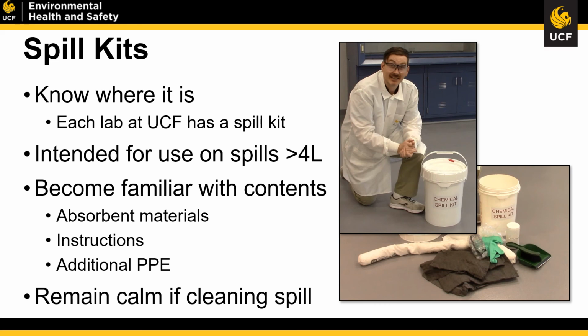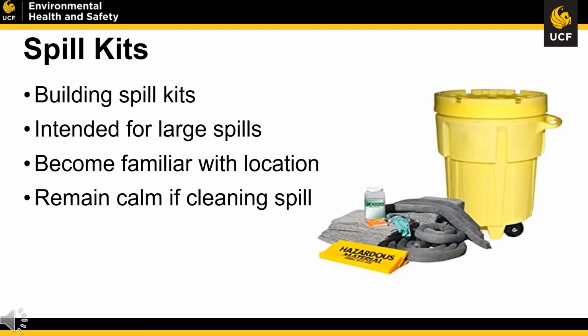There are additional spill kits in certain labs depending on their specialty hazards, such as mercury or hydrofluoric acid. Those spill kits are specific to those compounds. Please only use those spill kits for those hazards. Within the building that contains a laboratory that has specific hazards, there will be a building-based spill kit. The spill kit is designed for large bulk spills. Please know where the spill kit is, and please talk to your building manager to find out what materials are inside these spill kits.